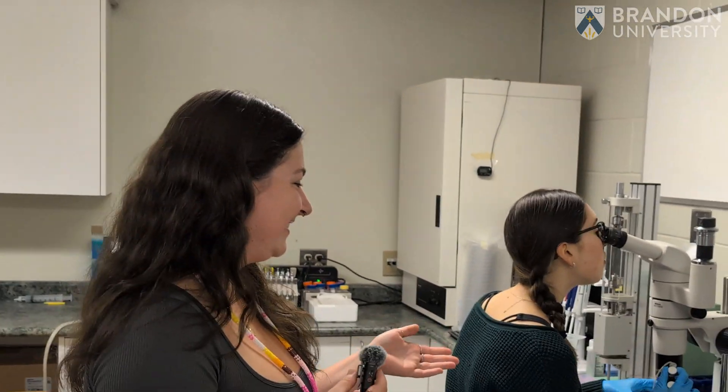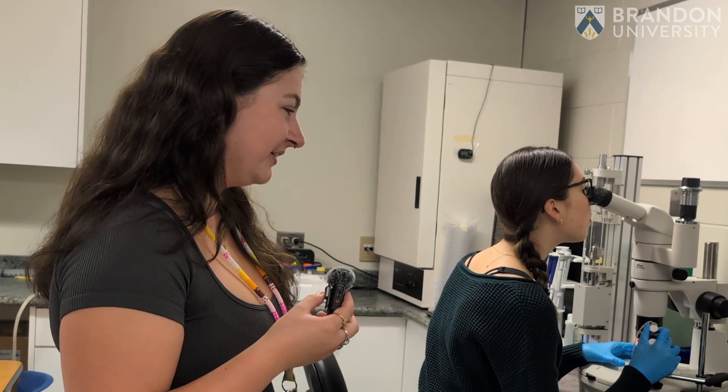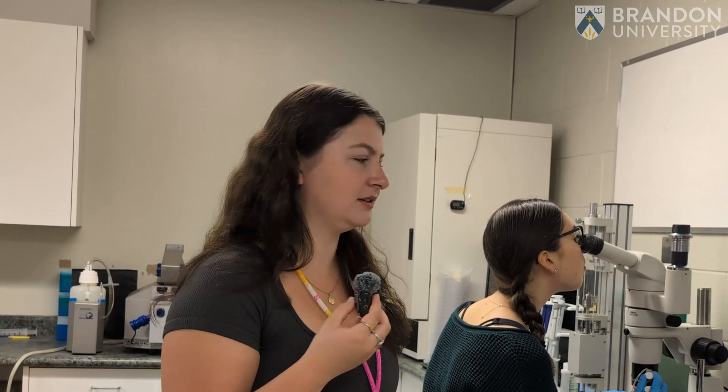When we actually do the micro injections it's a little easier to control the micro manipulator and the needle, because the micro injections have to be accurate in order for them to be taken up successfully. You also have to remember that we're dealing with a one to four cell organism, so we want to do them very little damage so that they have a high survival rate — because we are essentially poking them with a needle.